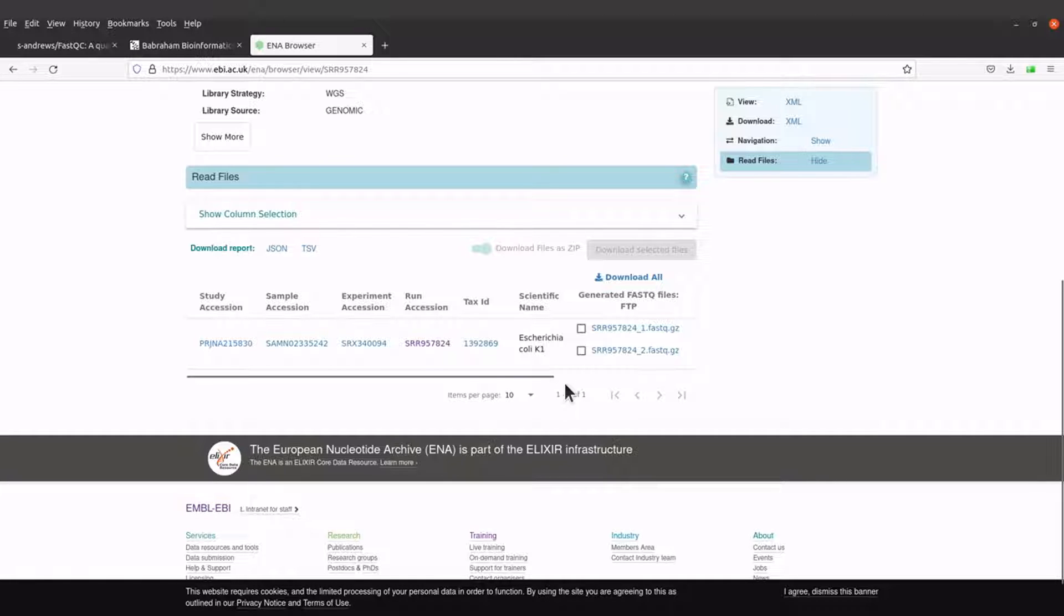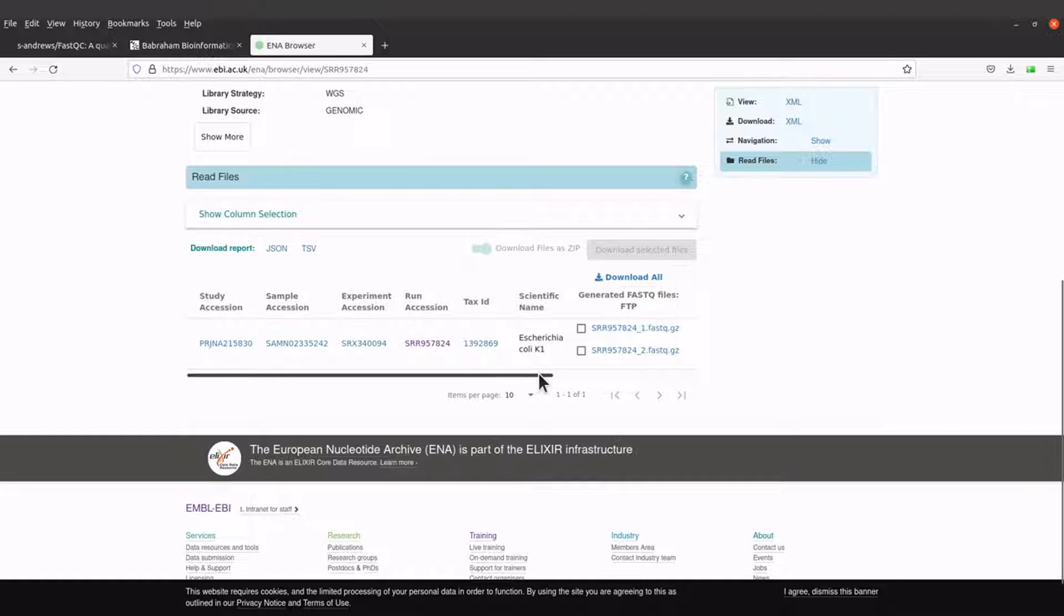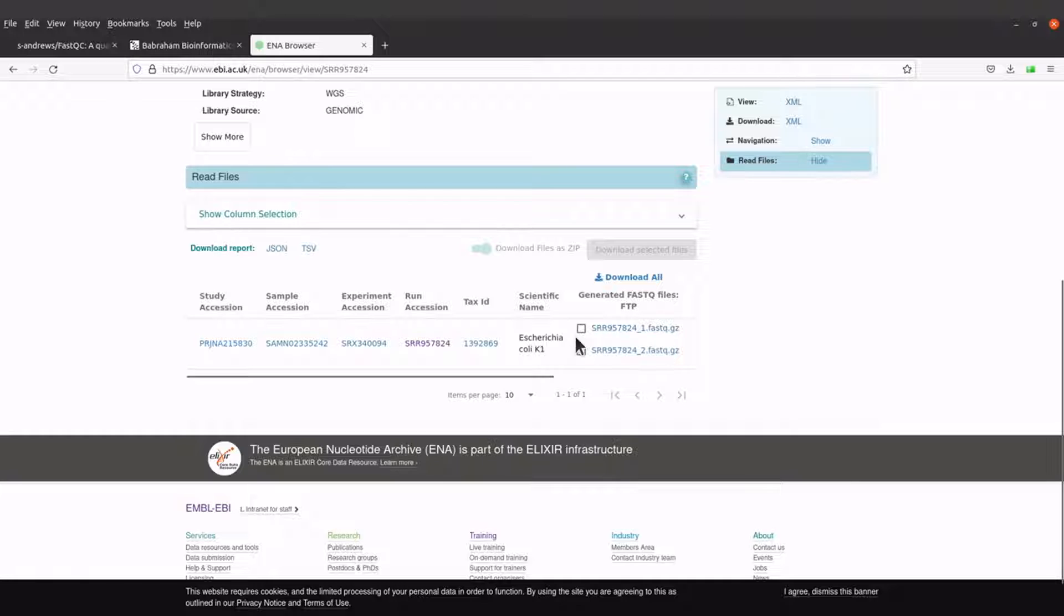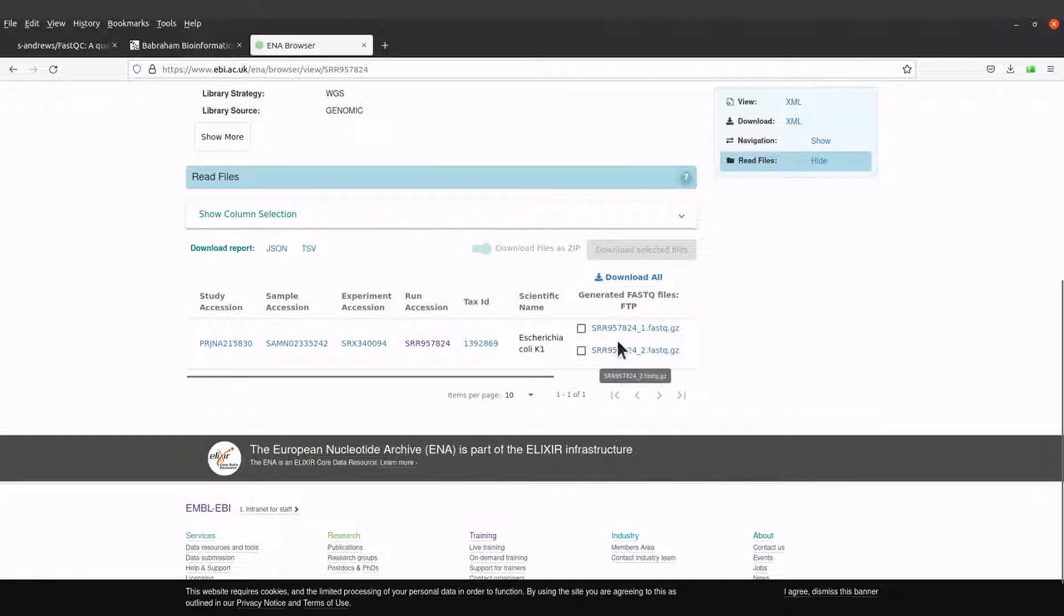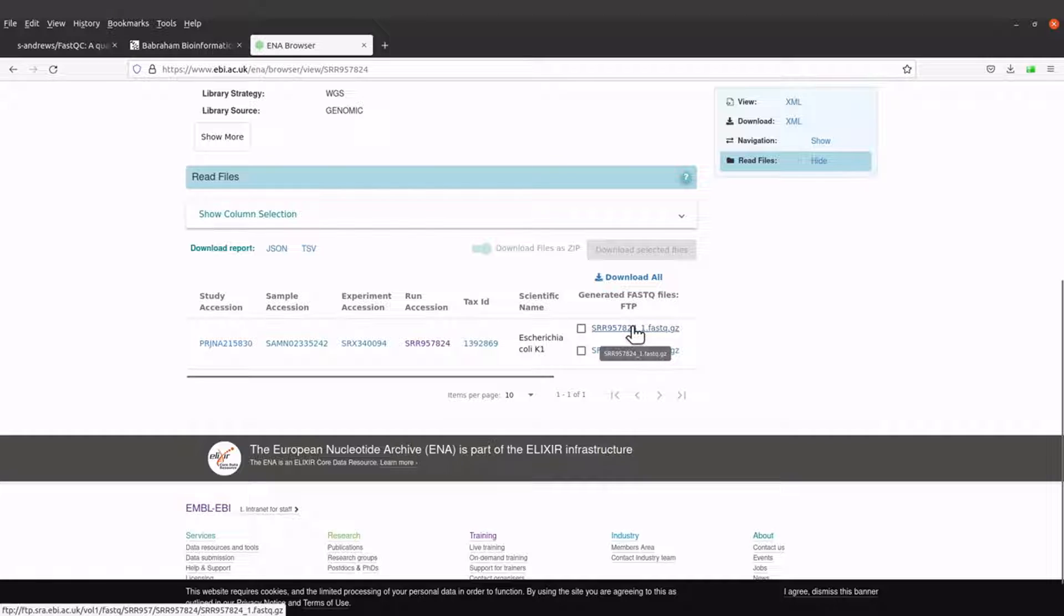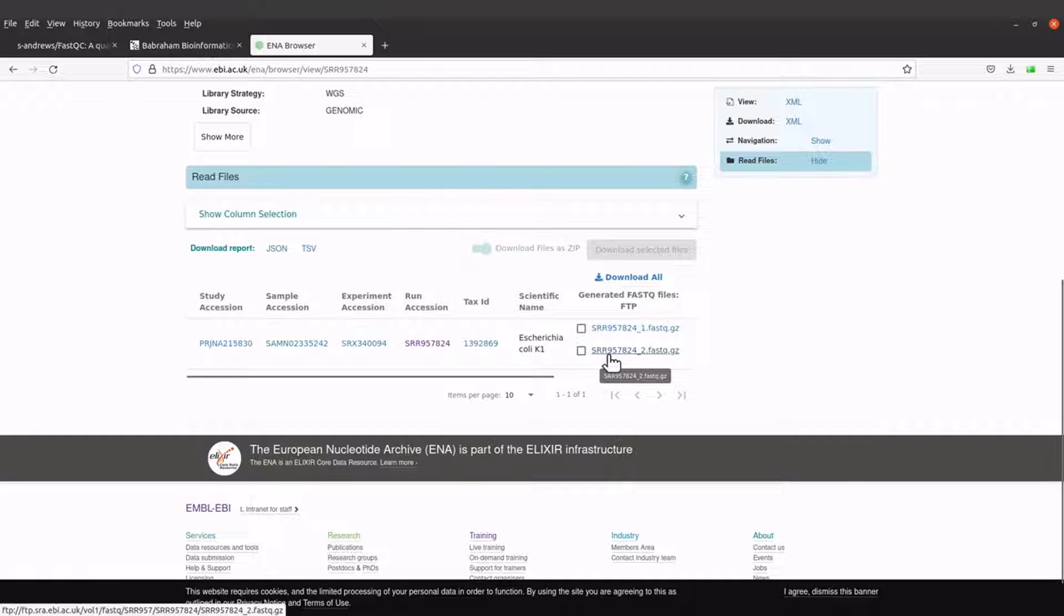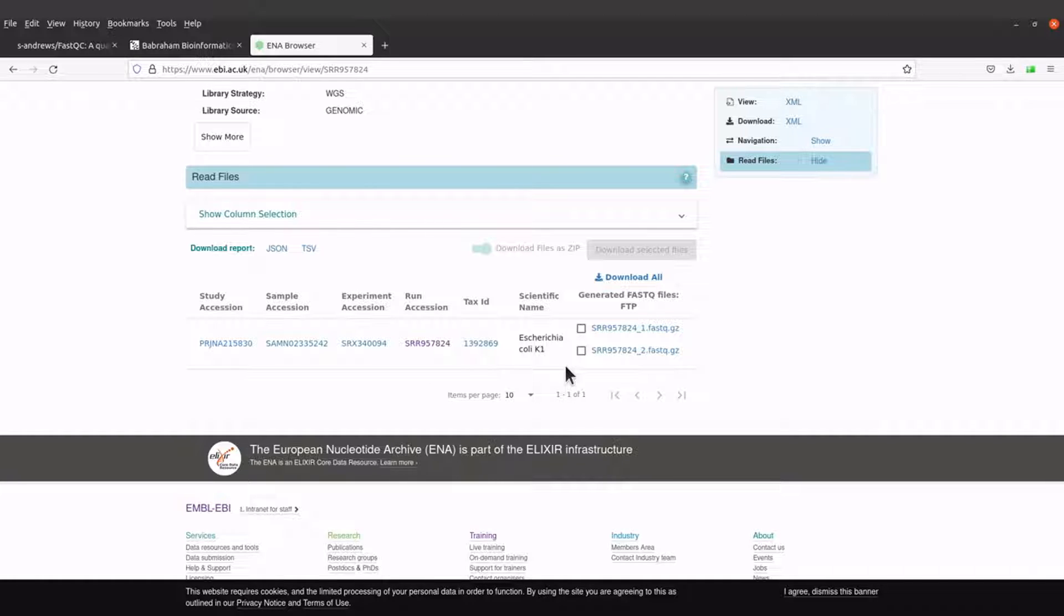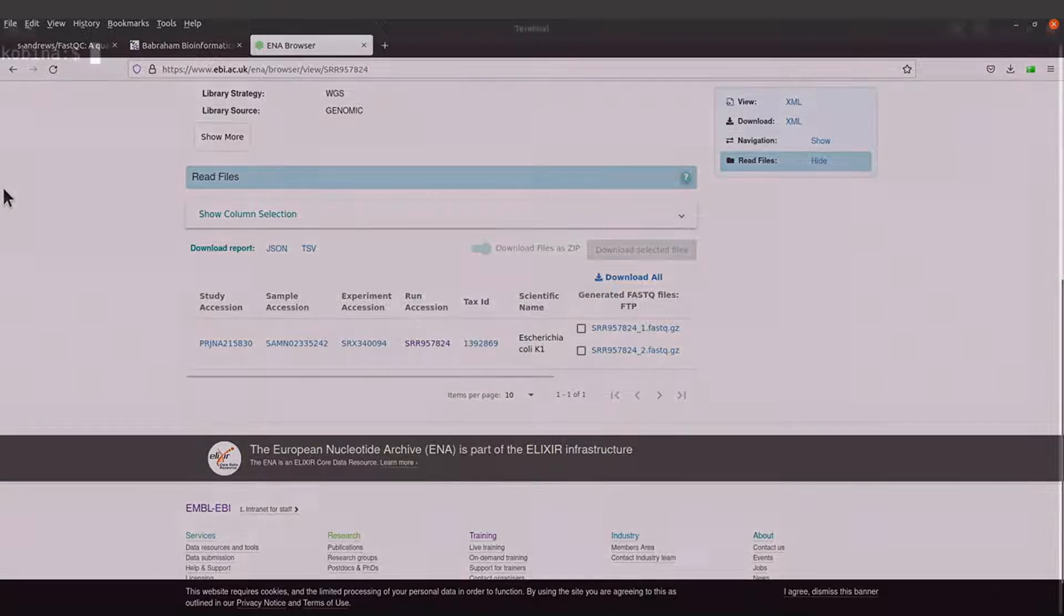It's for the same isolate, the same organism. We are going to download both, so make sure you get these two files on your PC. You can click to download or you can use the download link and download on the terminal. I already have mine downloaded, so I'll move to the terminal and we'll start the exercise.